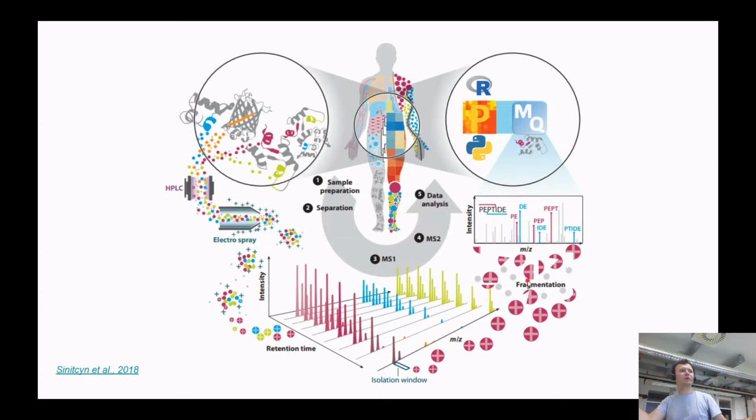What does it mean? There are many different ways to do fragmentation, but let's say the simplest one: we know that the peptide is positively charged. As a result, we can push all these peptides with an electrostatic field in one direction. But we also can take some neutral gas, let's say argon, and push it with high pressure in the opposite direction. Whenever these species collide, the kinetic energy of argon is enough to introduce one breakage into the peptide. This fragmentation is fine-tuned in a way that, statistically speaking, there should be just one breakage per peptide.